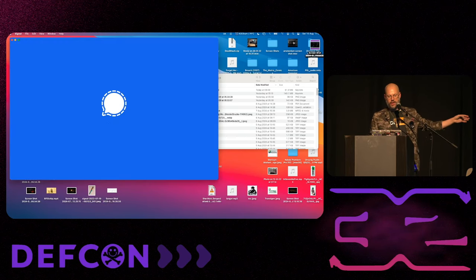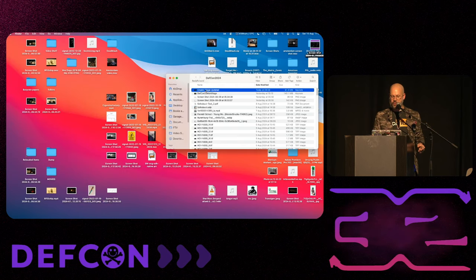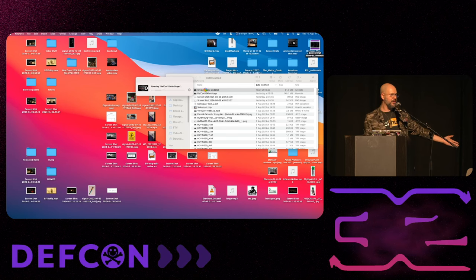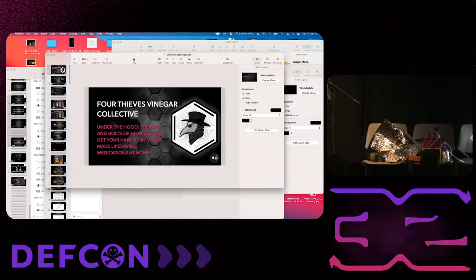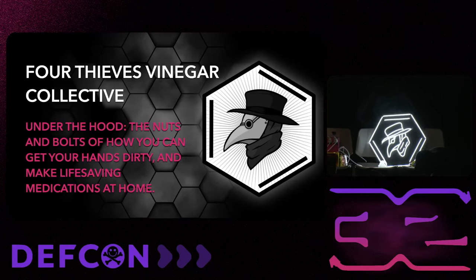We're going to show you the MicroLab. We're going to show you the online services, and we're going to show you, oh, and Vinny's light works. So you're going to see the MicroLab in progress. We're going to talk about how it's put together, a hardware and software stack. And additionally, you're going to be able to see the online services, which will be running live.